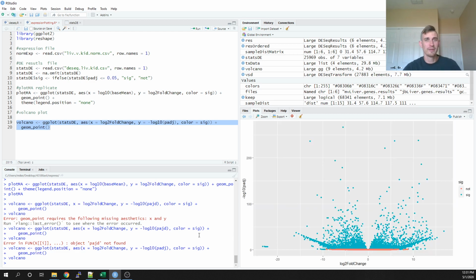All right, and so this is our volcano plot. So again, the log fold change is on the x-axis, so this is between negative x and positive x. Anything to the right is going to be biased towards the liver. Anything to the left are these gene expression values that are biased towards the kidney. The p-values are, again, log transformed, and not only log transformed, they're negative log 10 transformed.